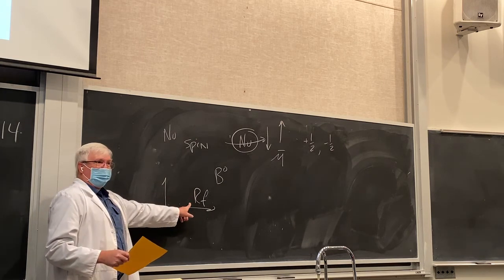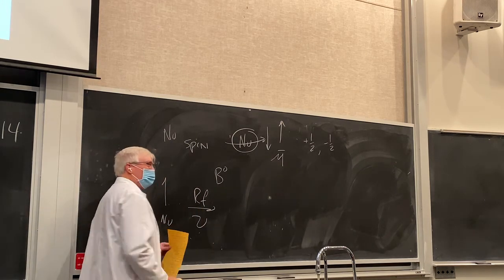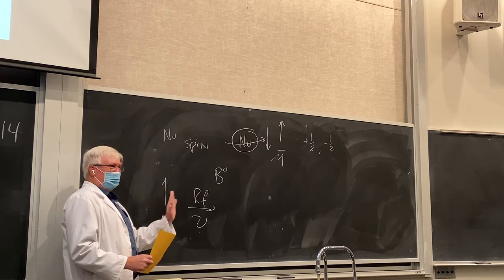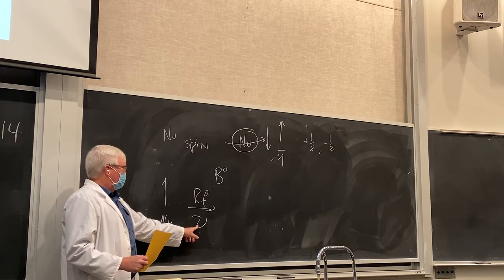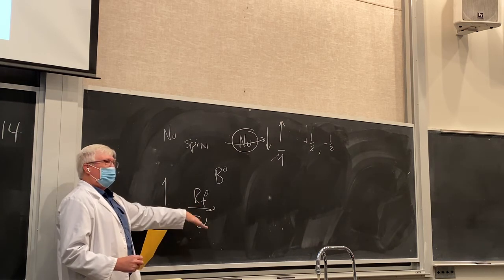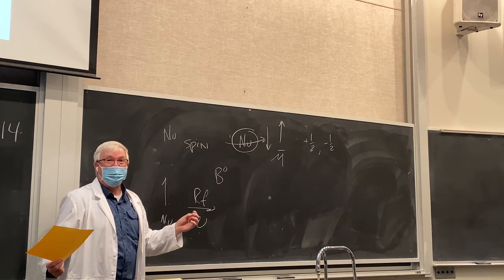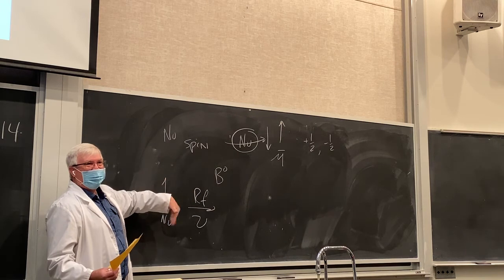When we apply the pulse, it depends on the frequency of the pulse, which is specific to the spectrometer and specific to the different types of nuclei and how they're either de-shielded or shielded. They can have little variations. That's the ppm variation there. This RF pulse brings that spin out of resonance with the external magnetic field. I'm using the term resonance, which we've used for movement of electrons before, but this is a different type of resonance. We're talking about being lined up with the magnetic field or against it.